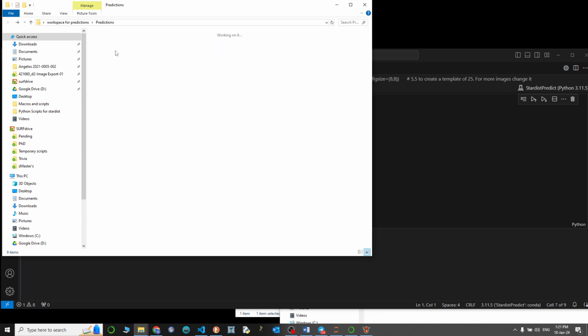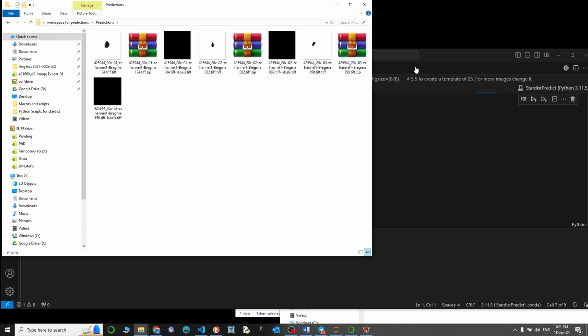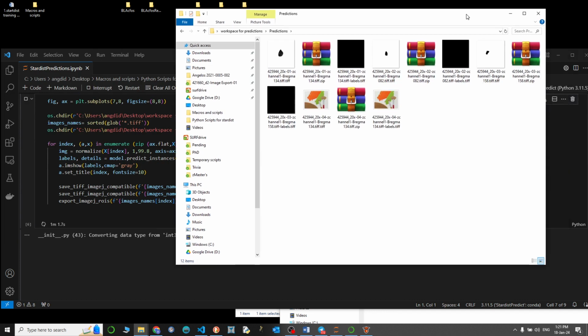And at the end, I want to gather all predictions into one file. For now, it's working okay. And it will probably run okay because I've run this dataset. But yeah, I'm going to stop the video now and I will show you how the results look.